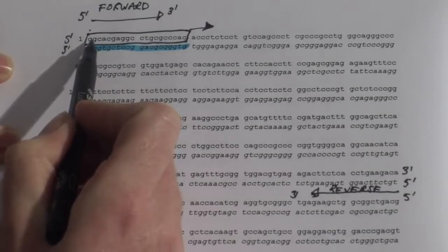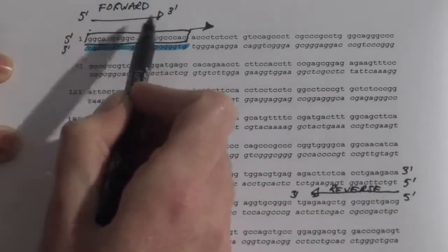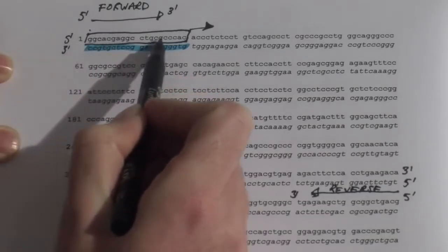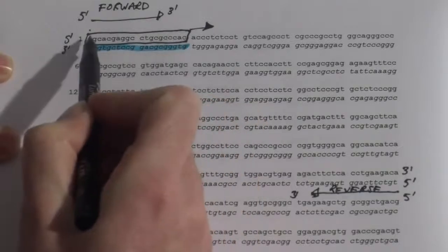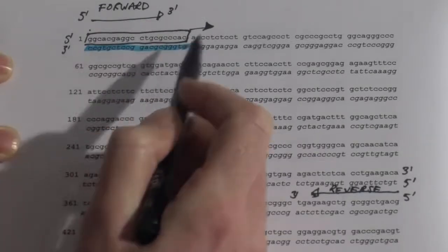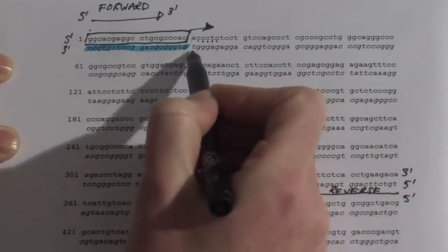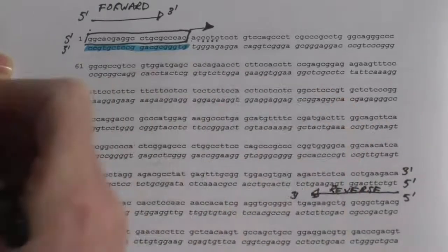You take the upper strand, sometimes it will be the only strand of DNA that you are shown, you orientate it 5' to 3', and the sequence is as you read it here. If this is the sequence, it's binding to the complementary strand, and these are the nucleotides that it will start to synthesize as it reads along the complementary strand here.